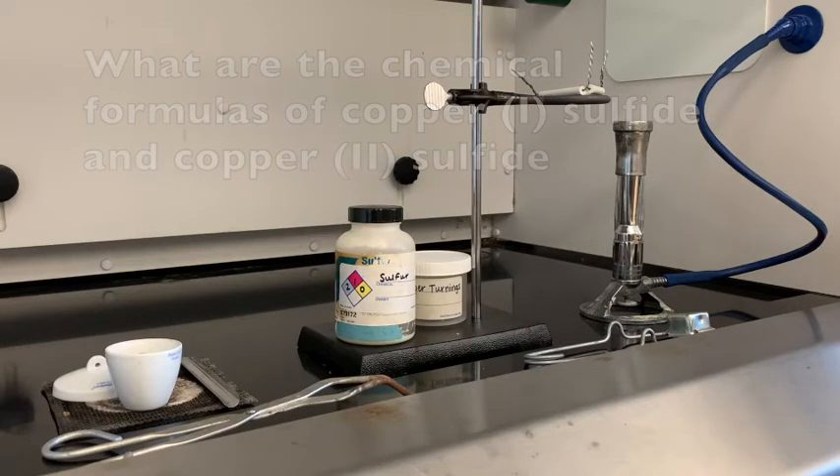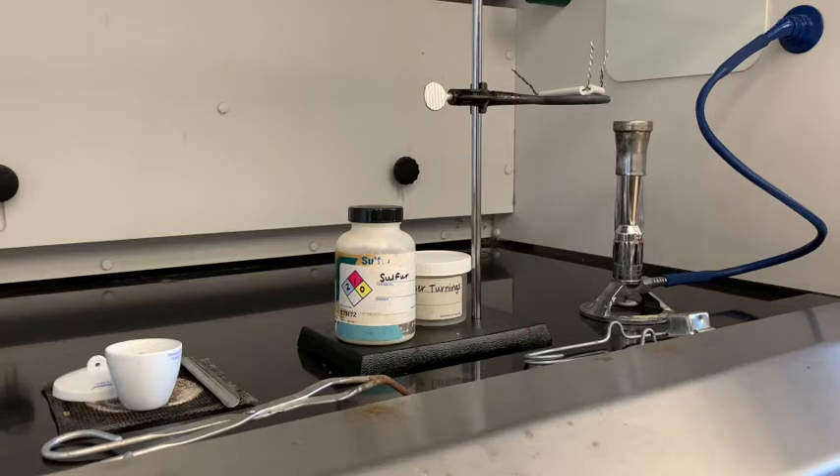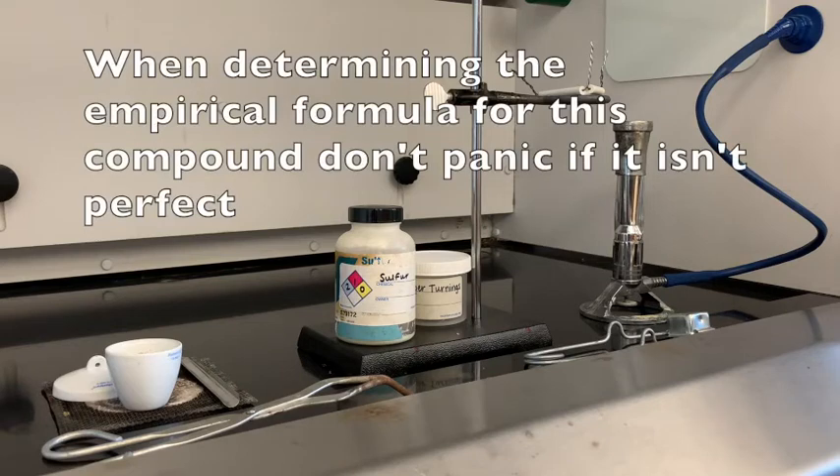Sometimes in this lab you don't always get copper 1 sulfide or copper 2 sulfide — you get a mixture of both of them. So if your chemical formula, once you determine it, doesn't match copper 1 sulfide or copper 2 sulfide, it's okay. It's the process of getting to that empirical formula that you're after today.